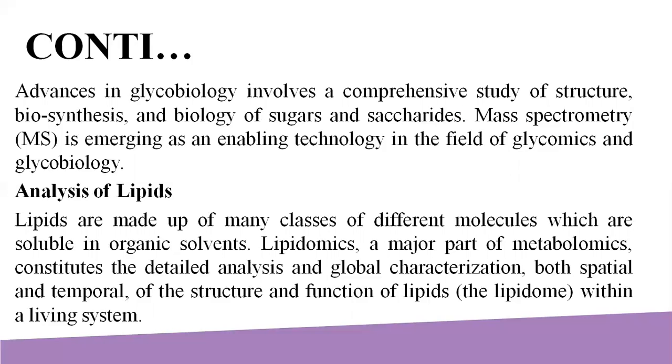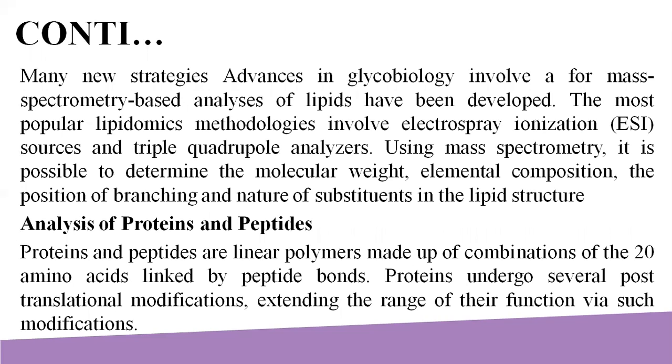Analysis of lipids. Lipids are made up of many classes of different molecules which are soluble in organic solvents. Lipidomics, a major part of metabolomics, constitutes the detailed analysis and global characterization, both spatial and temporal, of the structure and function of lipids, the lipidome, within a living system. Many new strategies for mass spectrometry-based analysis of lipids have been developed.